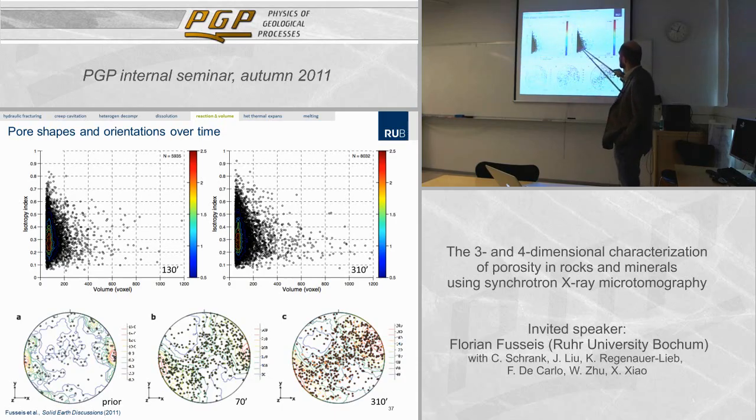So that is about the end of the experiment. We see there's a slight shift in this curve, in this cloud of points, but it's still indicative of the same thing. So there are very few pores that actually have these shapes.